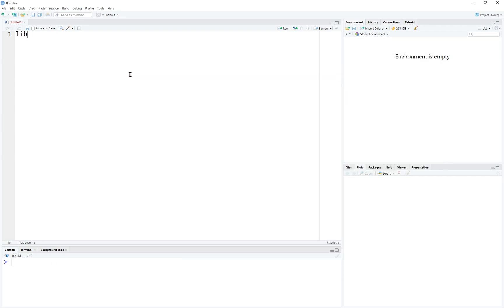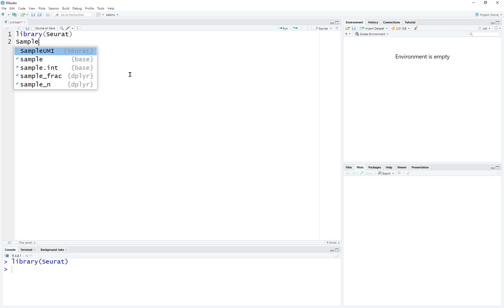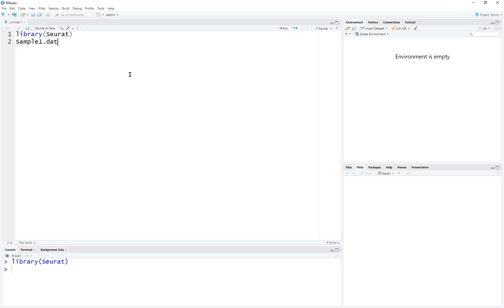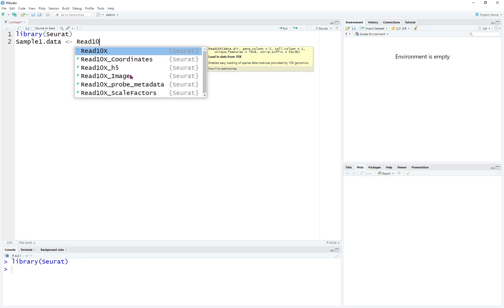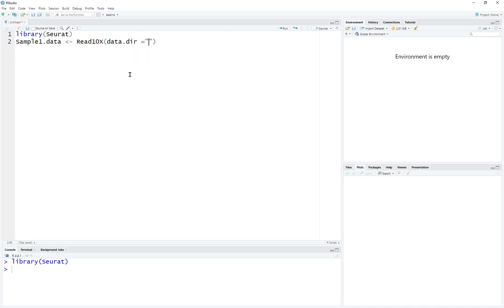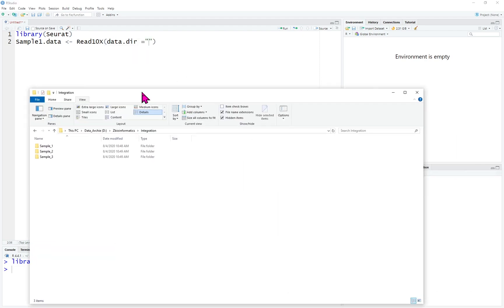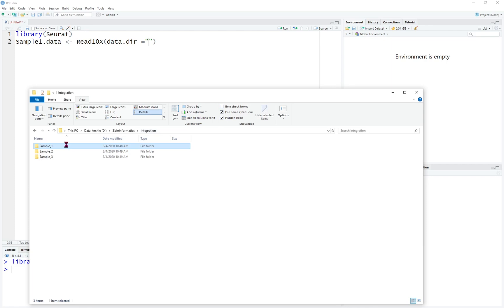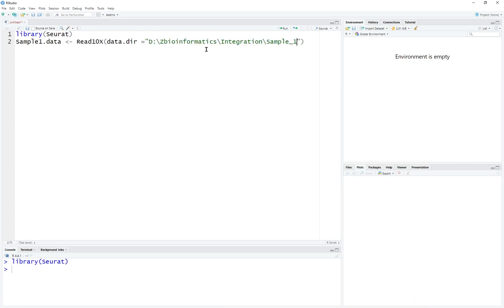We're going to run the code and then import the sample. For example, the sample 1 data is going to equal to — we're going to use the Read10X function and provide it the directory. The directory is going to be data, equal to the specific folder, and it depends on where you put it. We're going to use sample 1's folder name and copy this folder path as the data directory.